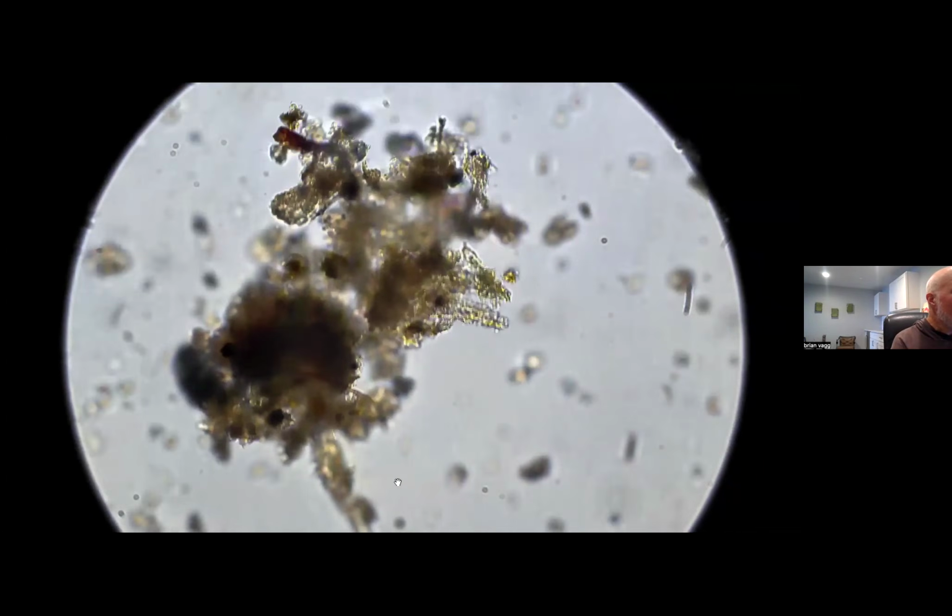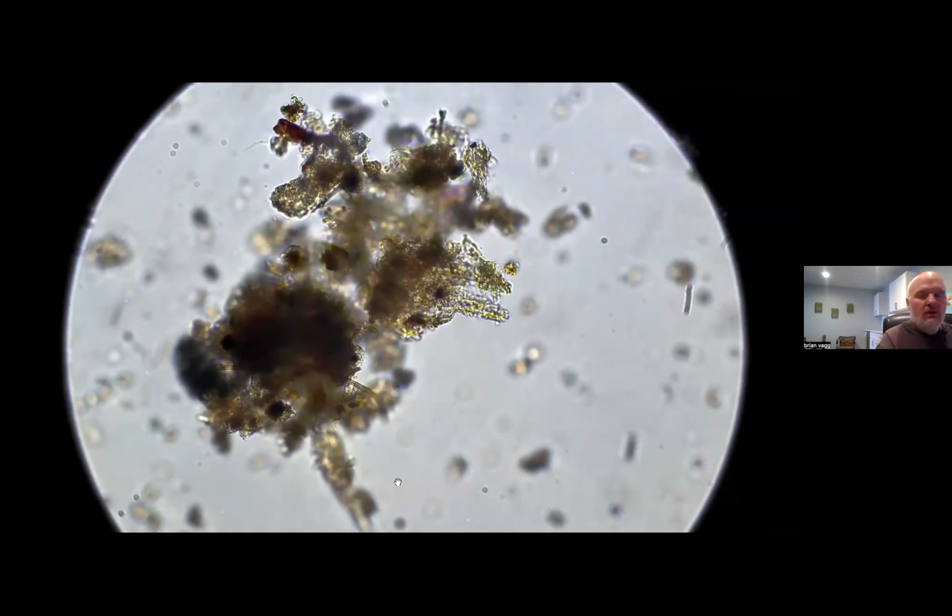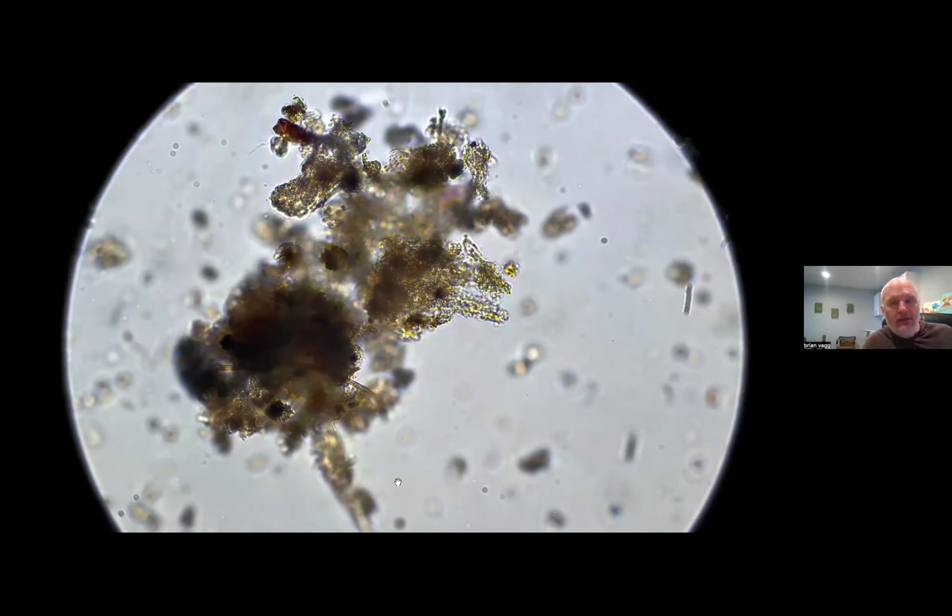And here's a good point that Keisha pulled out. Look at the aggregate that we're looking at right now. Aggregation is a really important aspect that microbes provide to you in soil. They build soil structure. So bacteria create all these biological glues that are going to start to piece together the sand, silts, and clays or organic matter into these microaggregates. And then fungi will weave that all together into macroaggregates. And in fact, when you look at an aggregate, you can see all the nice rich colors that are here.